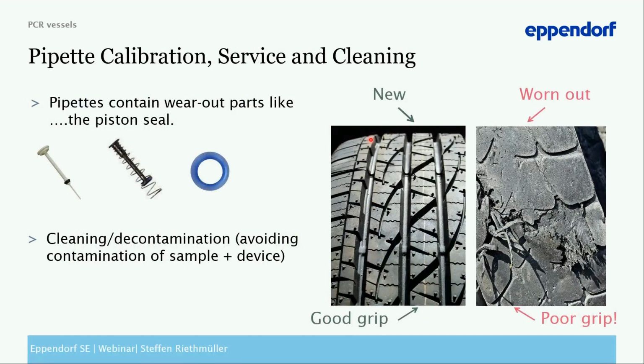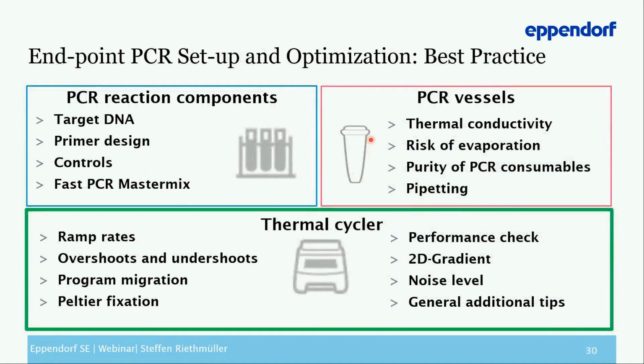And sometimes it's also needed to calibrate the pipettes and do service, and there are some wear-out parts like the piston seals, and sometimes it makes sense to replace them to have the best performing pipette. Okay, and this leads me to the last section of today's talk.